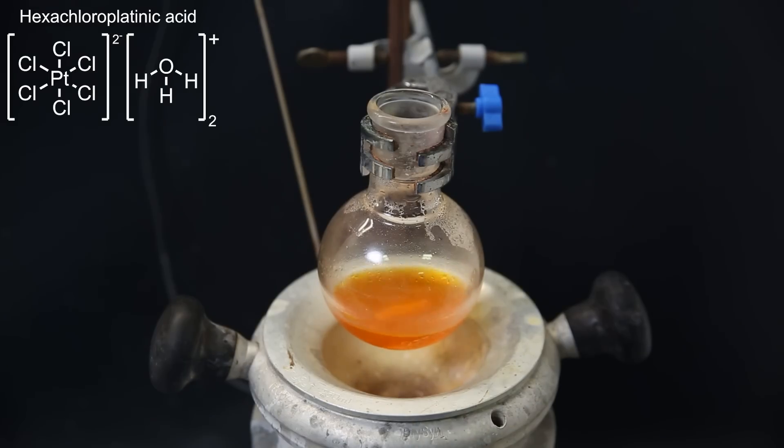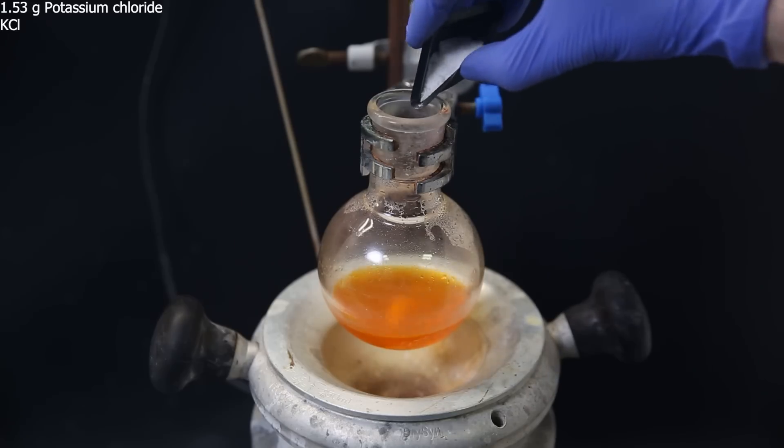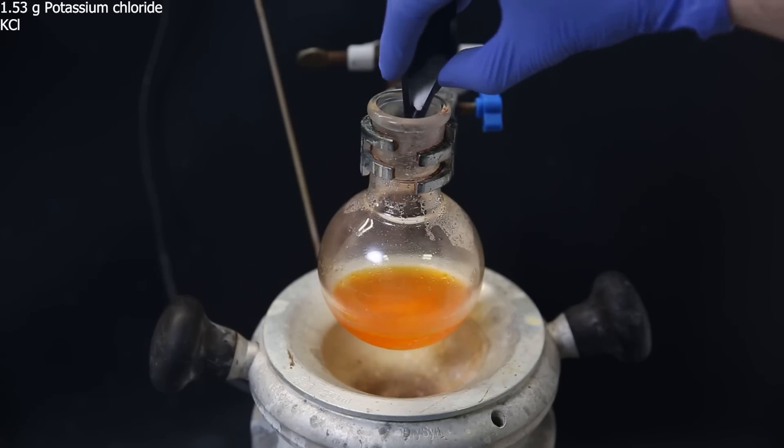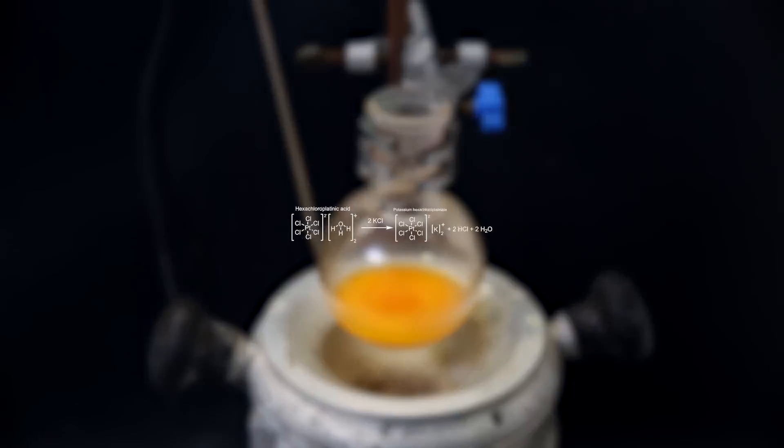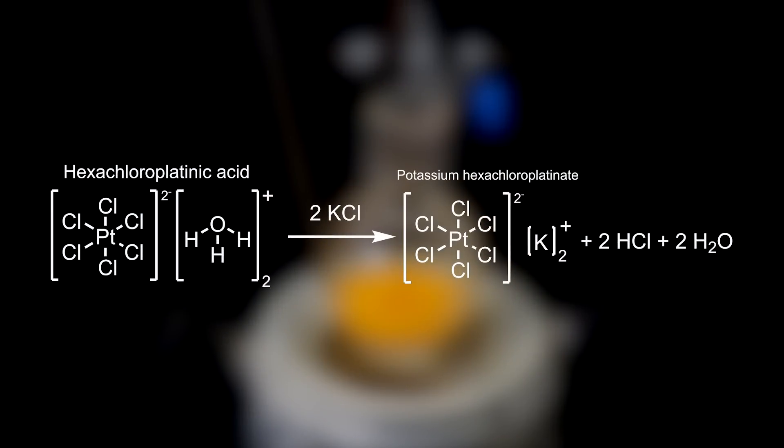Now for the next reaction, to the hexachloroplatinic acid solution, I add 1.53 grams of potassium chloride, which immediately reacts to form a yellow product. In this reaction, the hydronium ions are displaced by potassium ions to form the yellow insoluble potassium hexachloroplatinate, which precipitates out of solution.